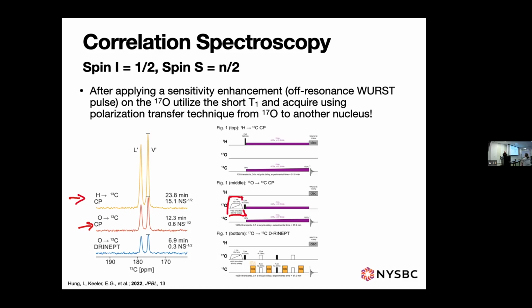It's a 12.4 kilohertz pulse, and that's just to enhance the oxygen-17 satellite transitions to the central transition before we knock down and then spin lock on the central transition and try to simultaneous spin flips to the carbons. You can see here that you get a spectrum that looks pretty similar. It's got a little bit less signal to noise, but it's acquired in half the time.